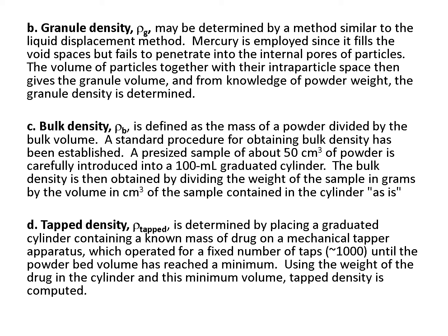So if you want to compare the tapped volume with the bulk volume, it will contain the same 3 values but in a lesser amount. That means the tapped volume contains the true volume of the solid as in the bulk volume, and the intravoidage as in the bulk volume, and the intervoidage as in the bulk volume, but the intervoidage volume in the tapped will be less.